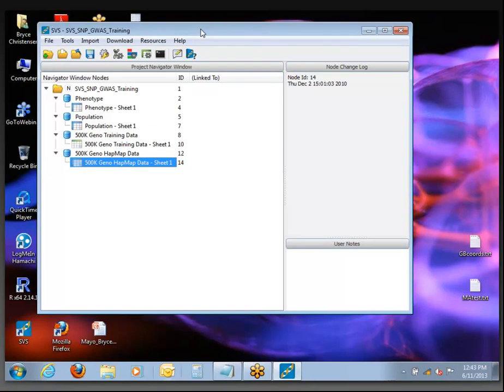I'm going to click on Open Existing Project. If you can find where the bundle was installed on your desktop or somewhere else, just navigate to it here.